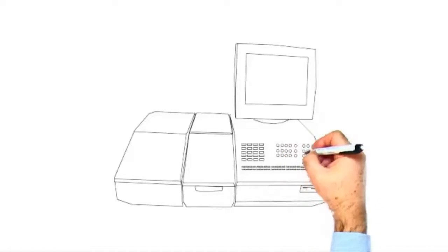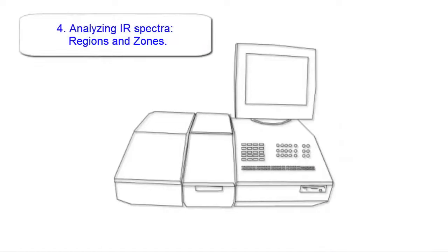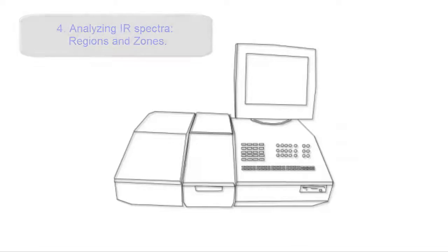Finally, I will show you a number of different infrared spectra and acquaint you with the 2 different regions and 5 different zones used in the analysis.